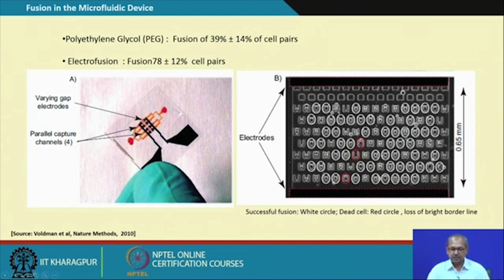And this is a picture showing which hybridoma cells survived and which did not. Among the survivors, there is a clear-cut demarcation of the periphery, whereas for the dead hybridoma cells there is no clear-cut demarcation.